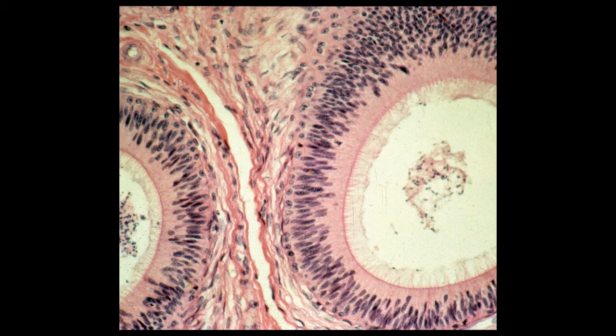What would their fine structure be, and how would the fine structure of these stereocilia differ from that of cilia? You can also note basal cells in this profile of the epididymis, and these basal cells are indeed stem cells. This is a pseudostratified columnar epithelium, and we know that it's pseudostratified because if you look at the nuclei, they appear to be in very staggered layers.